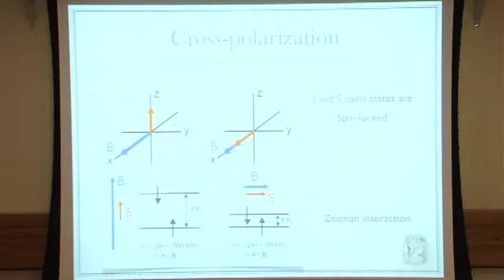So how does this work? In principle, you have the magnetization along z, and you apply a 90 pulse on proton, and later you apply the cross-polarization. When you apply the cross-polarization, basically you have your magnetization on the x-axis. You keep the magnetization on this axis, and you create a new field. When you think about the Larmor frequency, you think about the external field. But when you use a spin lock, you create another field that you now will use.